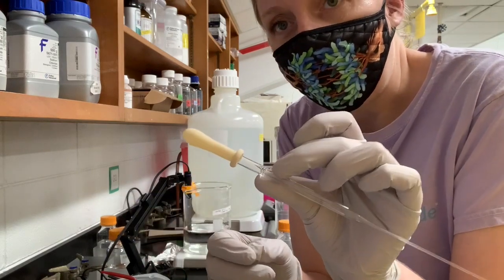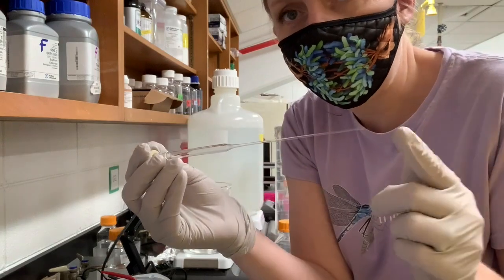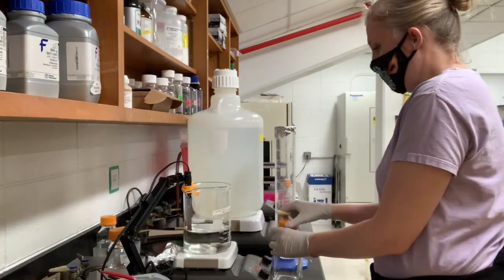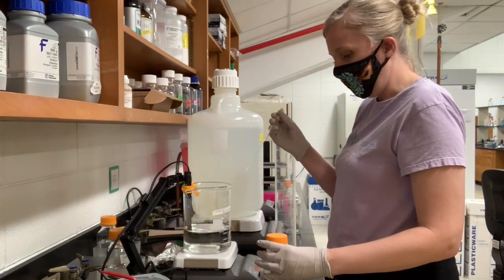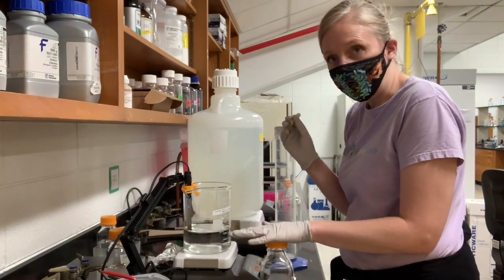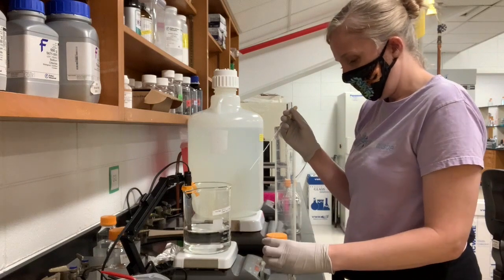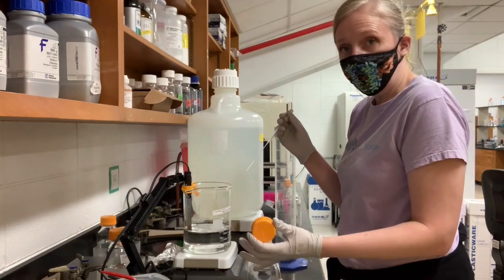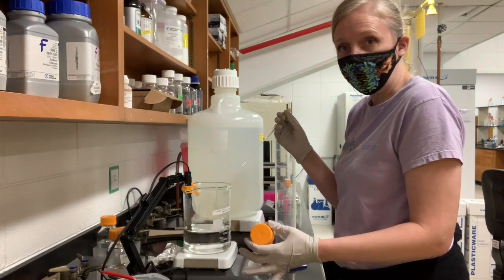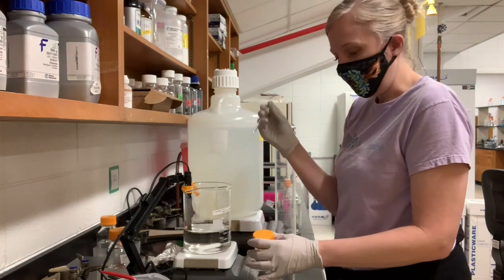So now that I have that on, I'm keeping this side sterile, but I'm going to come over here and very carefully pipette some of this strong base into my solution. I'm going to keep the lid on and work with the lid with my left hand and use my right hand to pipette.